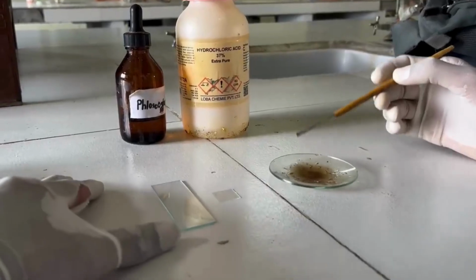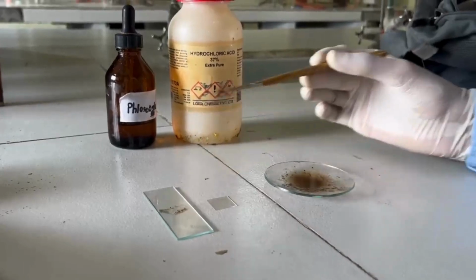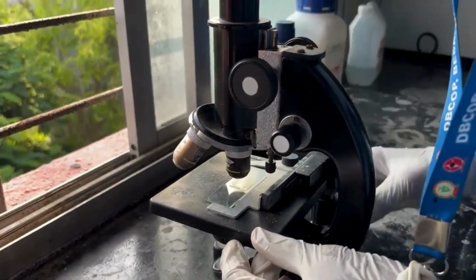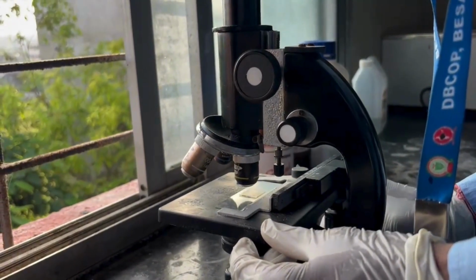After a few minutes, a smear is carefully prepared on a slide using a fine paintbrush. After placing the cover slip, the section is observed under the microscope. Through this technique, histological analysis and quality control of drug can be evaluated.